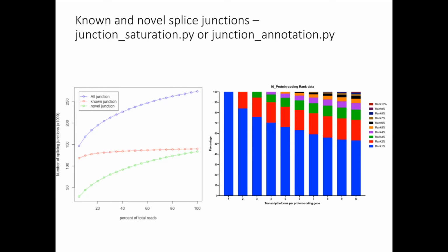The program that we are going to use throws away that information and only uses the uniquely mapped reads, which in most cases are sufficient. I'm not going to spend time on this, but if anyone wants to talk about it, that can be done in a private room.